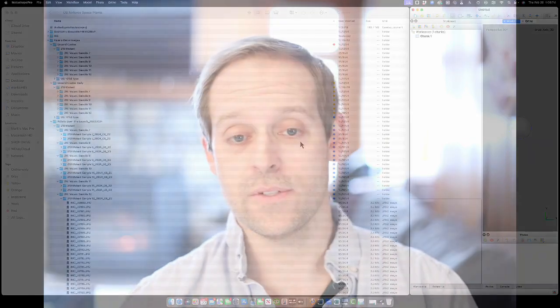And there are future experiments going up in space which will involve things like tomatoes and other types of plants as well. So stay tuned. Over the next couple of years, there's going to be more launches and more research in this area, and Macroscopic Solutions is really happy to be a part of that. But for now, what I'd like to do is turn to the data that we have on the computer. I'm going to show you how we have it organized and the steps we're going to take to refine the data and ultimately generate those 3D models.